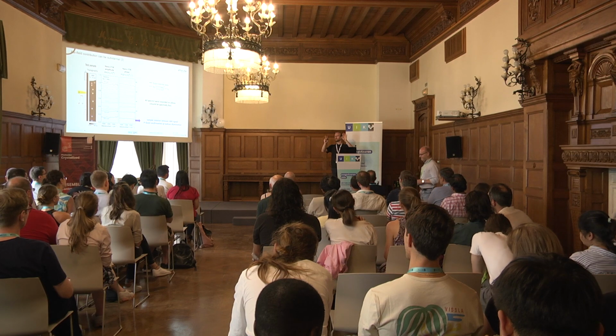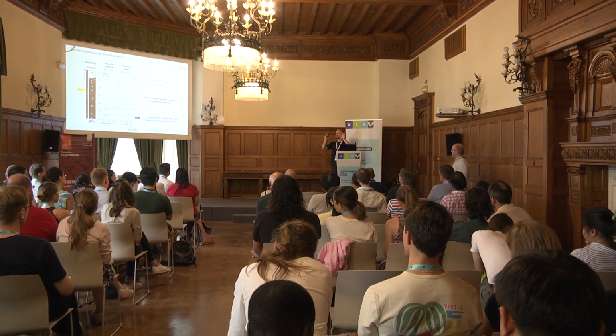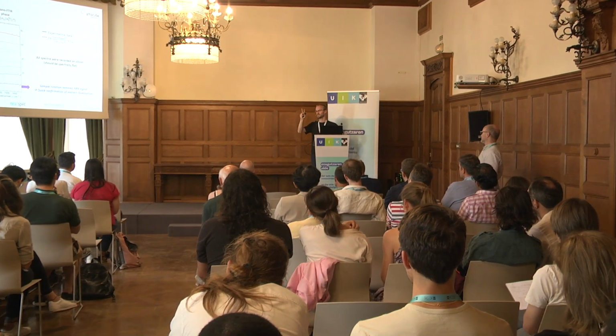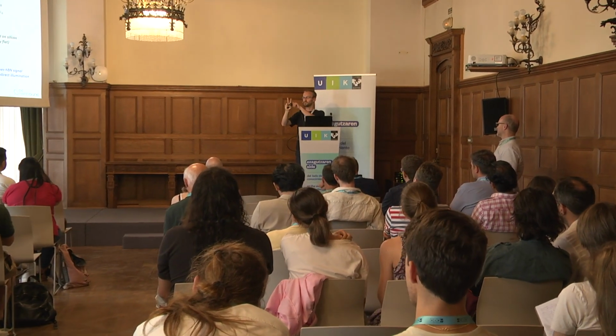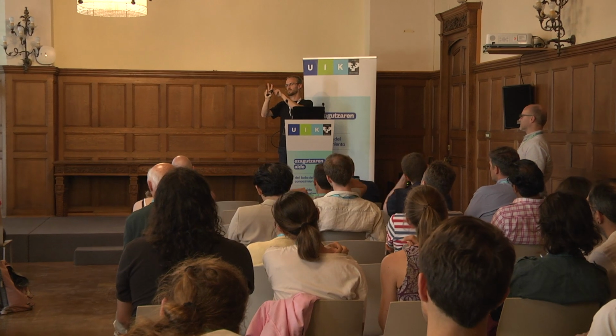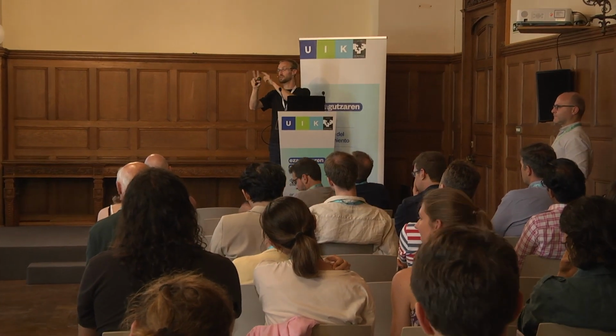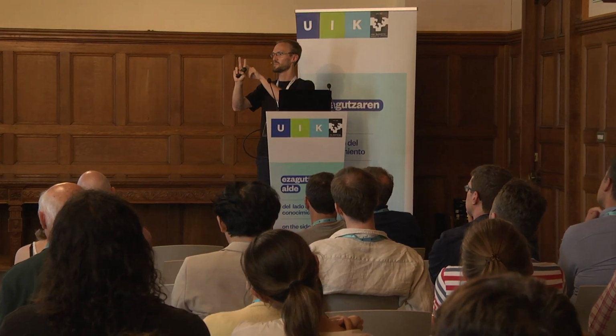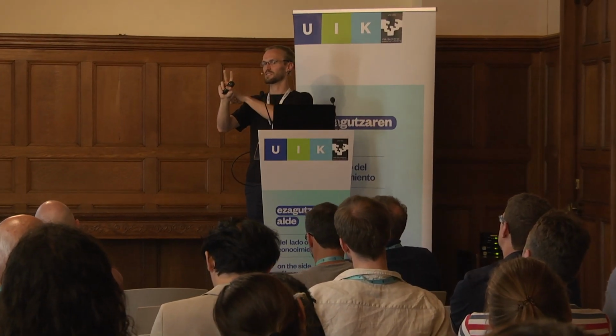By normalizing to a different harmonic, these water lines disappeared because they are just in the atmosphere. These 2 peaks were from tip contamination, so it was really material there. It was probed. It's a near field effect. If you normalize also to a silicon substrate, then these 2 also disappear. Not perfectly, but it depends on what the substrate and the sample are.